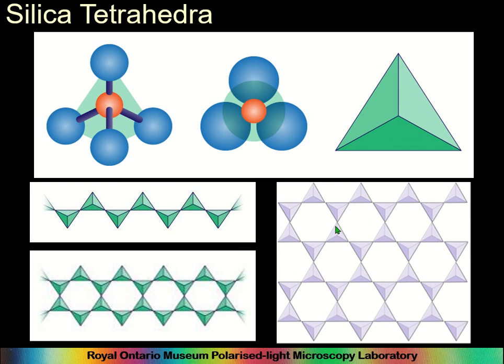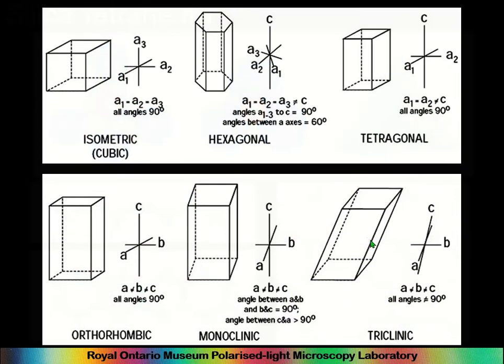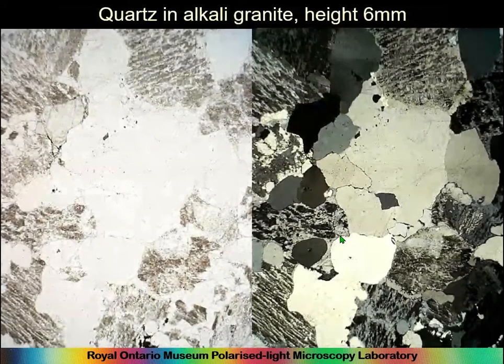So it's the structure that creates these cleavages, whether it's along breaks that we can see in these structures or transverse to them. Say if this was a plate in a phyllosilicate type thing, it would have a cleavage at right angles to this view from here. And so it's this structure that creates these cleavages, and they're oriented quite often in relationship to the structure of the crystal itself. So you can imagine something like this might have two cleavages at right angles, and this might have two cleavages at 120 degrees or so.